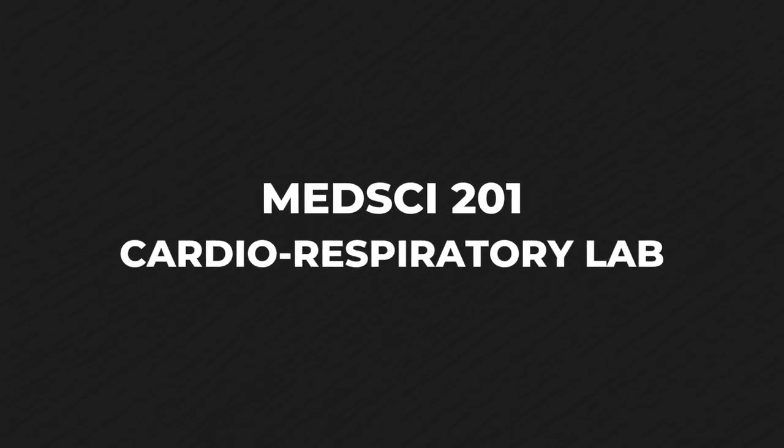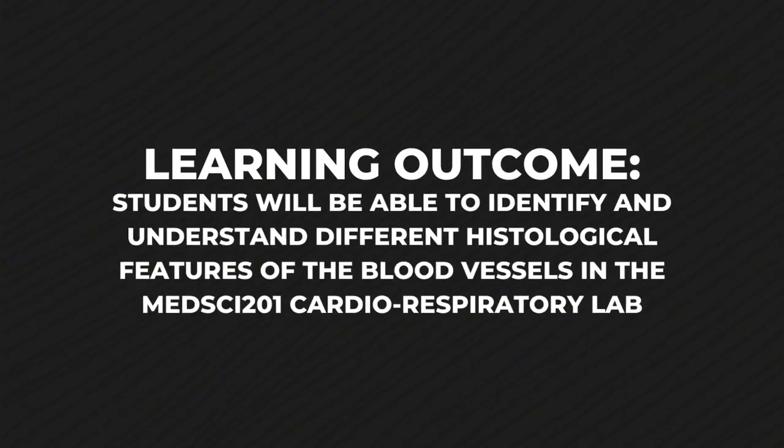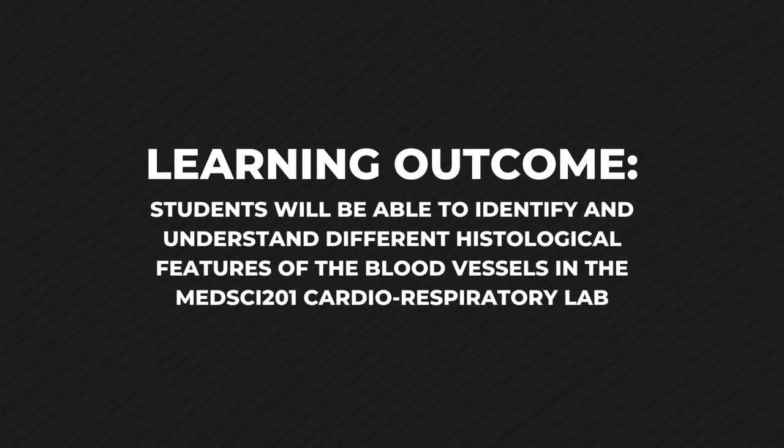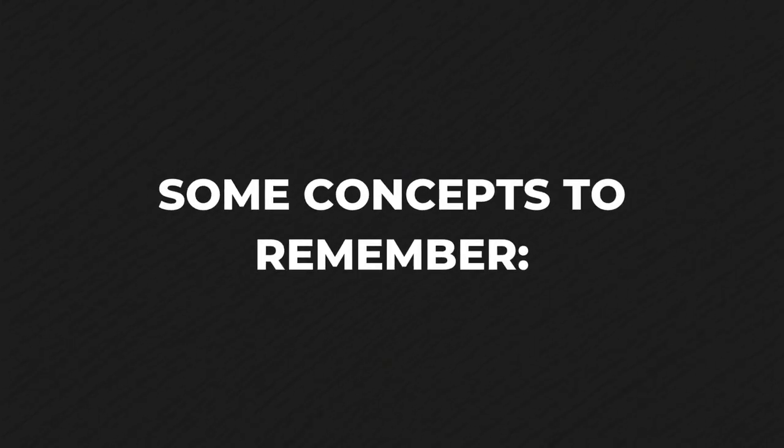Welcome to the MEDSCI 201 Cardio-respiratory lab. The learning objective is to recognize and describe the histological features of arteries, arterioles, and veins. The learning outcomes are that students will be able to identify and understand different histological features of the blood vessels. Here are some concepts to remember.